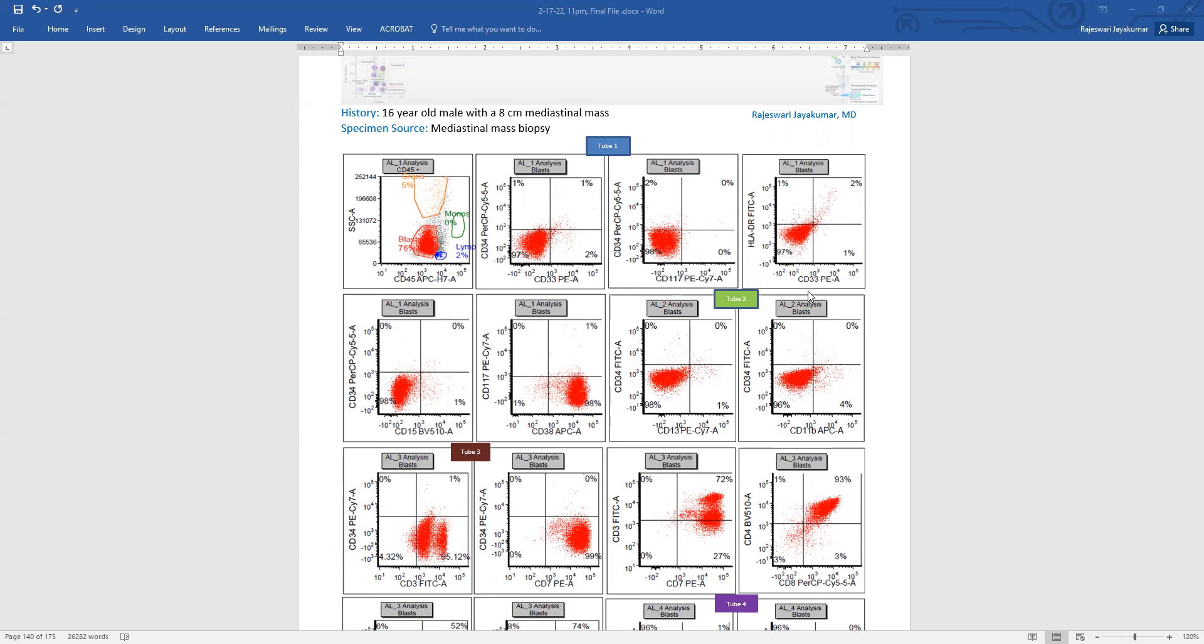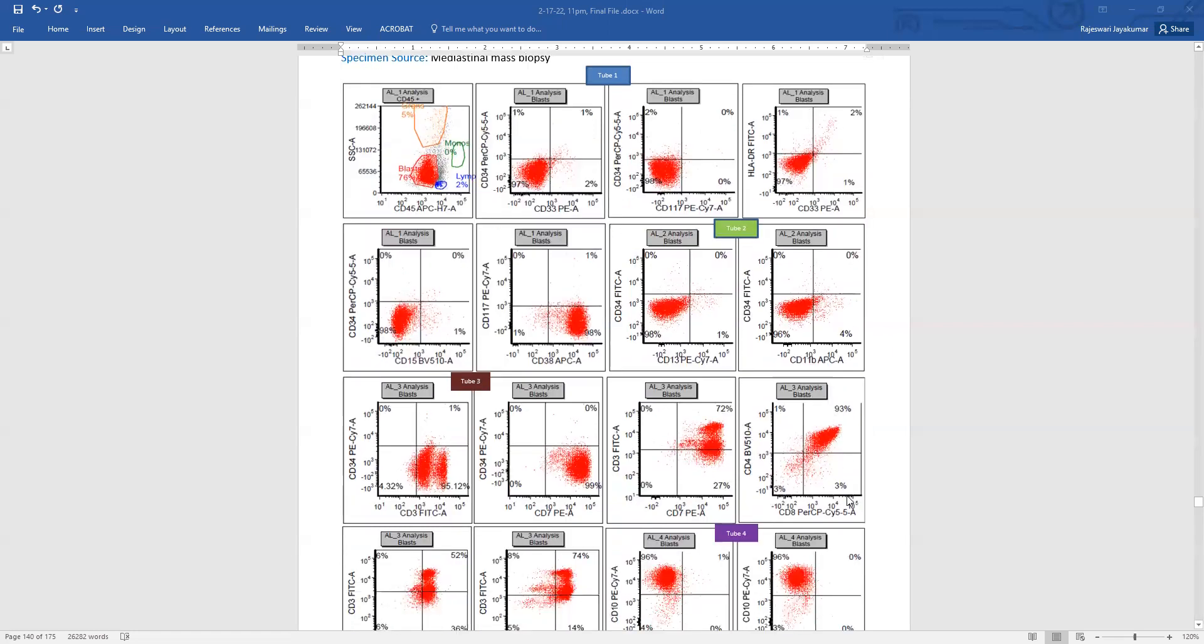So as we see here, we can see that they do not have CD34 expression. They do not have the expression of myeloid markers like 117, 33 or 13, no monocytic markers, negative for 11B. And they do have T cell markers, surface CD3, CD7, and they are double positive for 4 and 8.